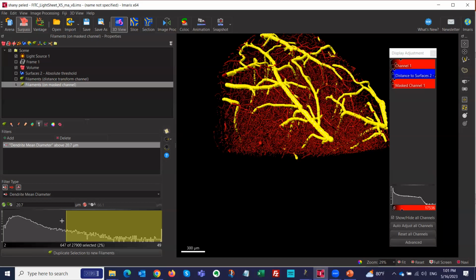You tell the software this is all foreground, even the inside, and it will learn from it, and then you can use it to continue. It's been done quite a bit since we released it. So machine learning is definitely a tool for this exact problem.